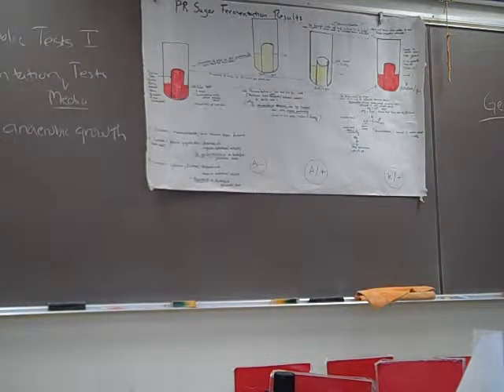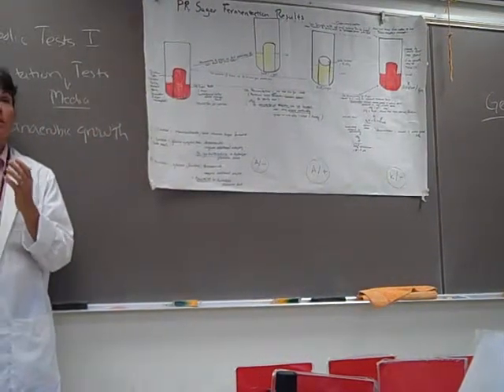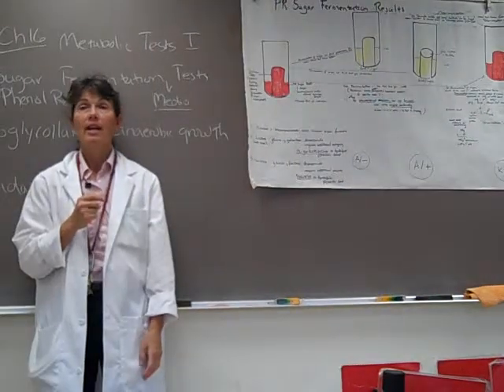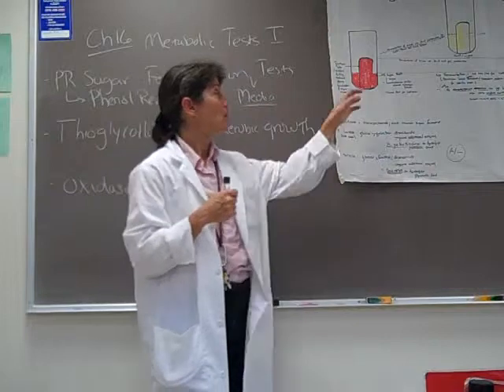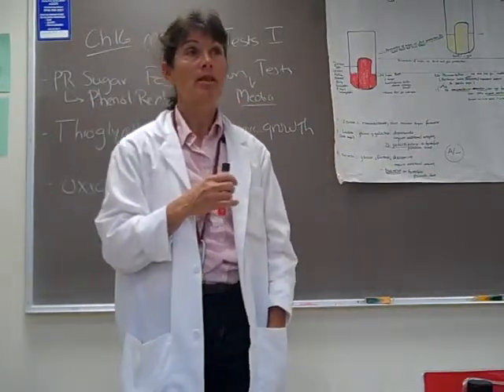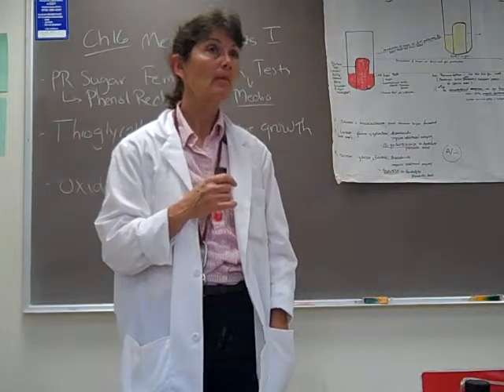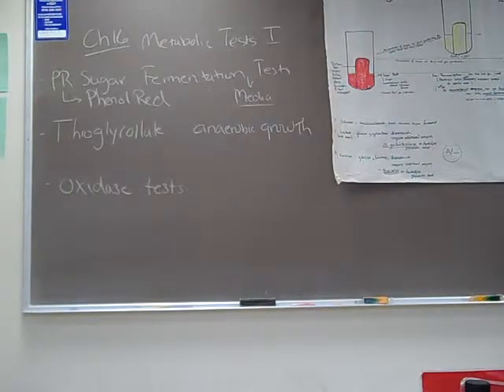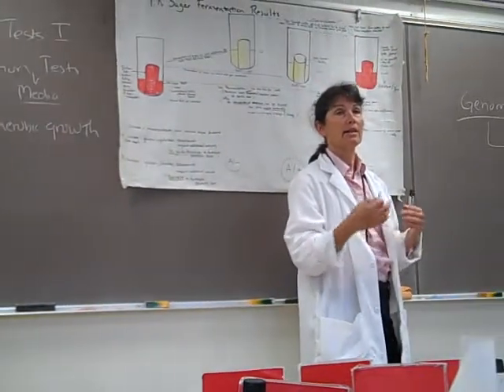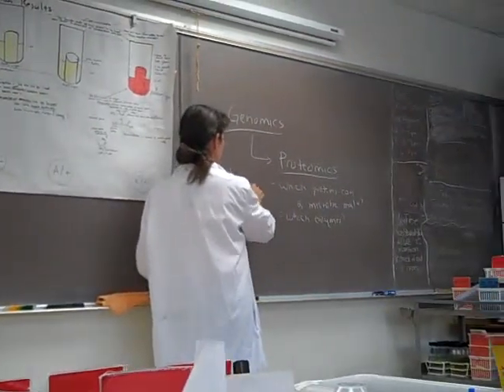So we talked about the Phenol Red, we talked about the sugar. Now, in addition, in the media, there will be an alternate carbon and energy source, because we're going to discover some of our microbes can't use these sugars, and we need for them to grow. You know, this test won't work unless the microbes are growing. So we have to provide them with an alternate carbon and energy source, and that will be proteins and amino acids in the media. Okay, so if your microbes can't use the sugars, what they'll do instead is they'll tear apart the proteins down into the individual amino acids.